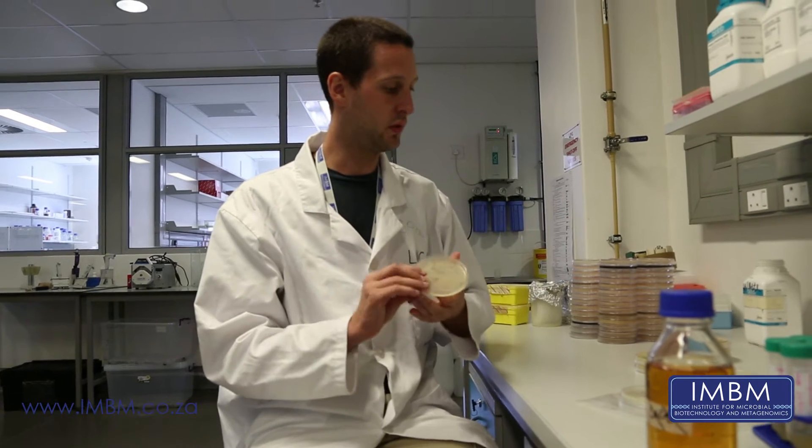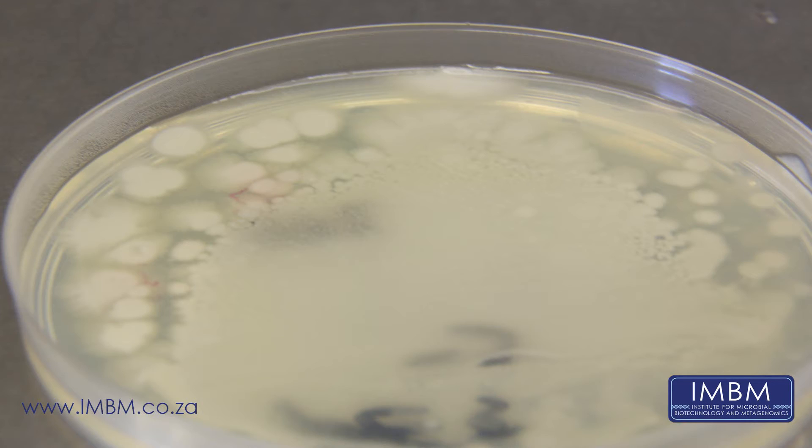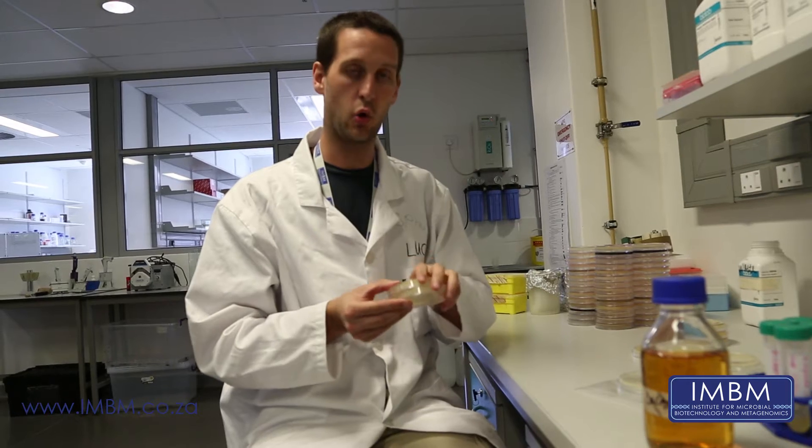This morning we are going to be doing an antibiotic overlay test. The idea behind this is that we can identify any antibiotics which our isolates are able to produce. As a recap, we started out with a series of dilution plates from our environmental sample, which has a whole range of bacteria growing on it.